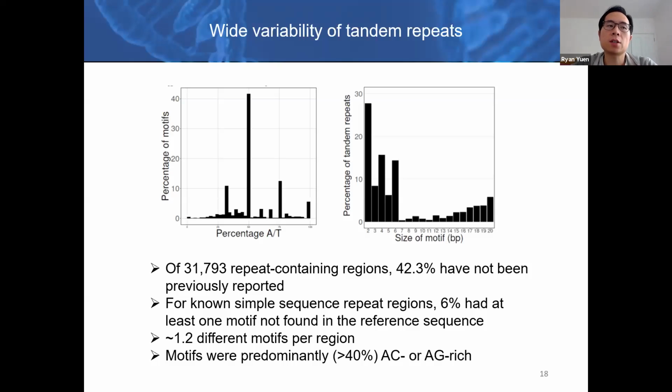So the statistical method that we use, we have to have controls, right? So the control is the unaffected siblings. Actually, we didn't sequence. We just got the data from the Simons Simplex Collection, where they have two parents, one affected child, and one unaffected child. So we use the affected child versus the unaffected child for the statistical method.